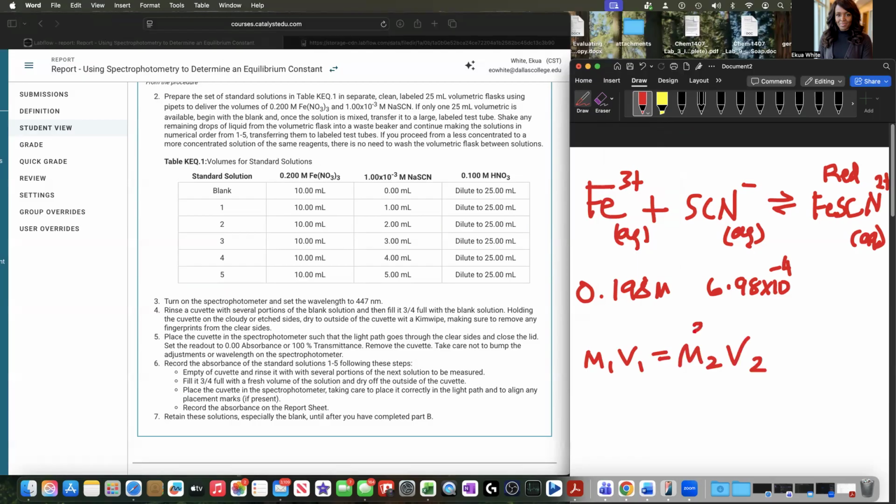We're trying to figure out the new diluted solution concentration, the diluted concentration of iron in the solution once you mix the 2 aqueous solutions together. Remember, they dilute each other, and their combination essentially causes a dilution of both ions. And we need to move on with the diluted version of the ions.